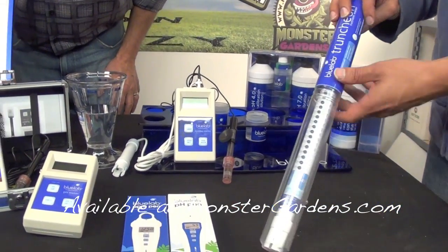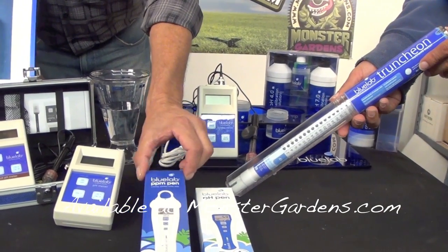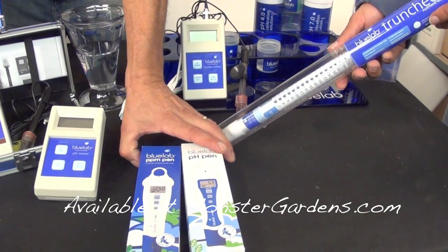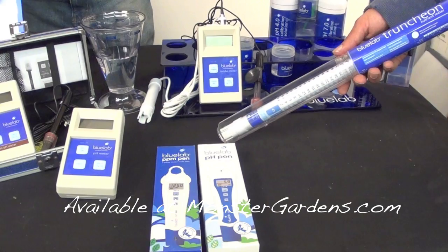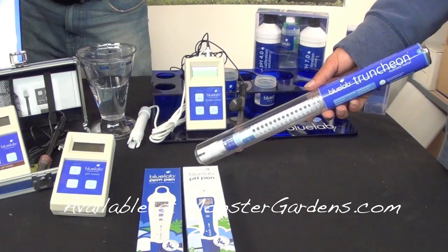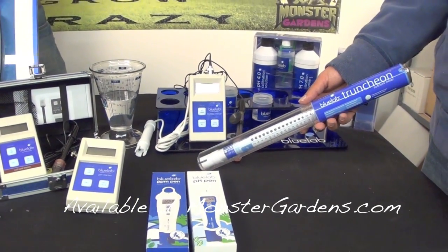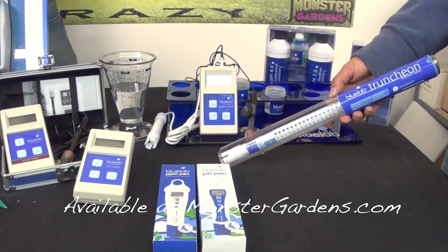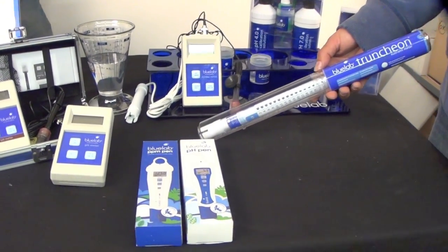This is the truncheon — that's one of the favorites. People love it. The only reason we came up with a pen that does PPM is some people like the digital readout compared to the light display. These are new from Blue Lab: the PPM pen and the pH pen — wonderful tools that also give temperature. Not all pH and PPM pens are alike — there's a lot out there that do not work well over time. Blue Lab has quality products that last. If you're into using a pen for PPM or pH balancing, please take a look at these new products by Blue Lab.